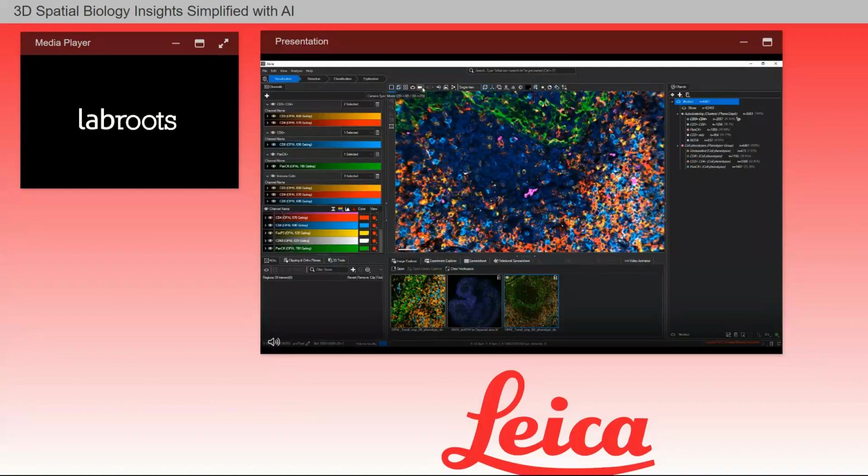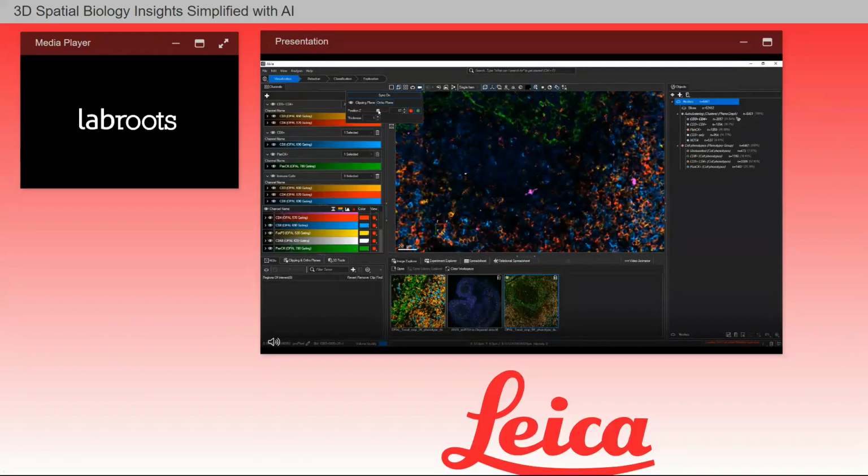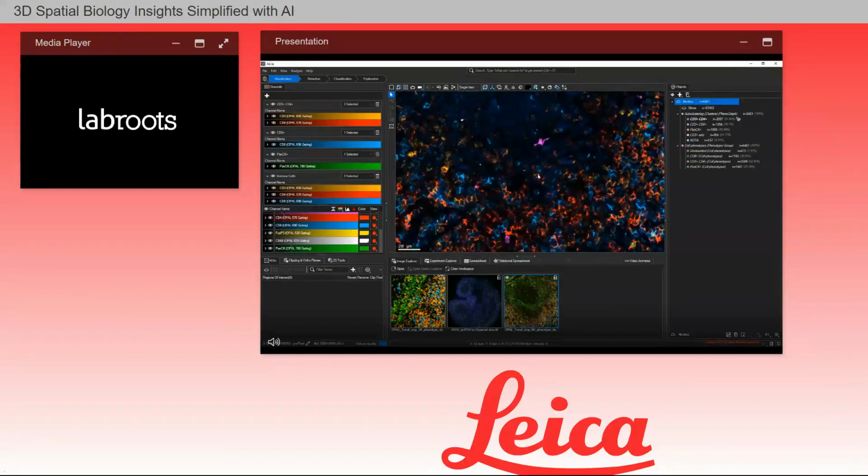Another new feature in Aivia 14 is the camera sync function for 2D and 3D. Let me click on the sync icon here to turn on the sync. And I have the option to show either a clipping plane or an ortho slicer. I can then use the slider to control the plane position in Z. And I can pan around my image in 3D as usual.